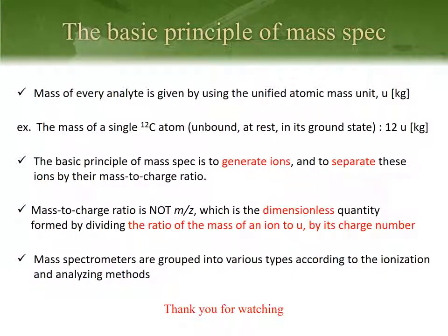Mass spectrometers are grouped into various types according to the ionization and analyzing methods.